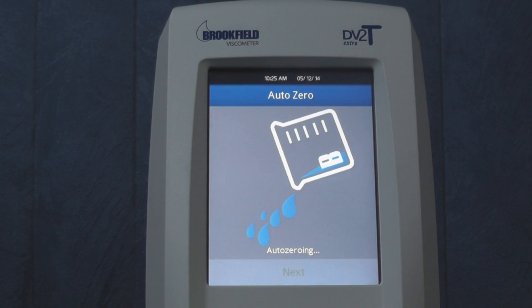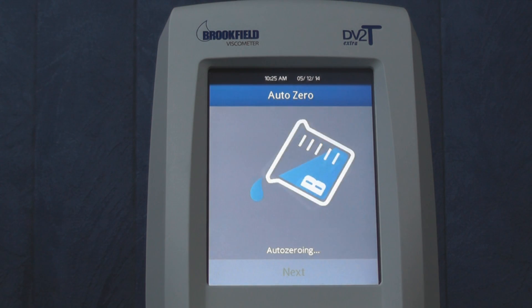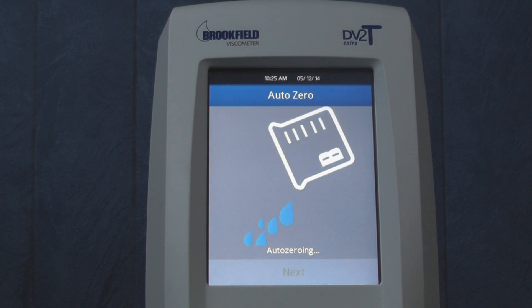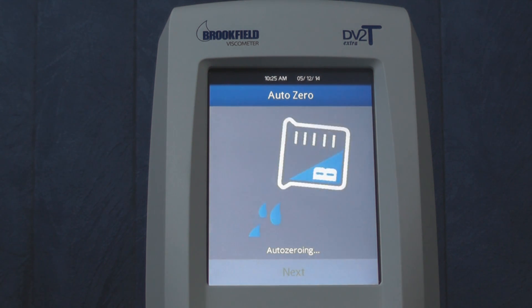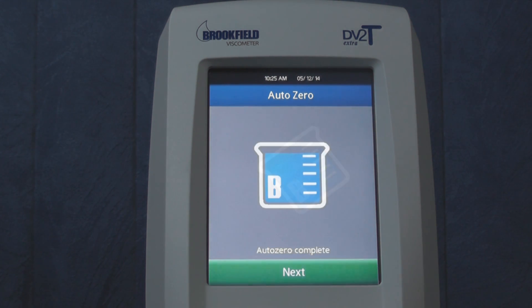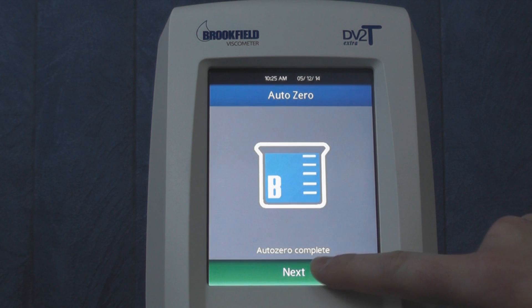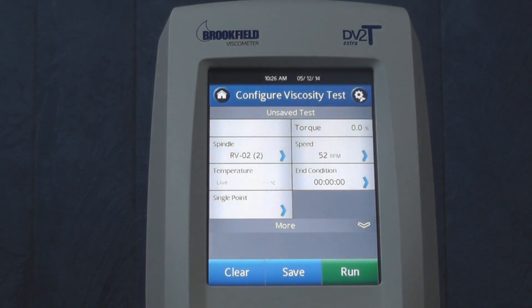When you power on your instrument for the first time, you will first need to perform the AutoZero procedure. Once completed, press the Next button and it will bring you to the Configure Viscosity Test screen.